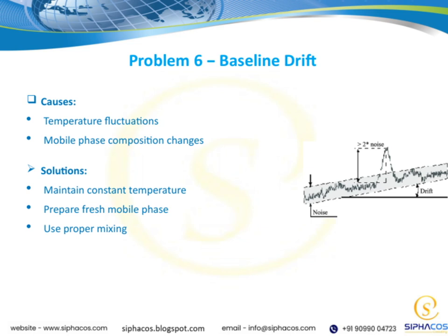By focusing on these solutions, we can significantly improve our baseline stability, making our results more reliable and accurate. This ties into the overall goal of achieving robust and reproducible chromatography results.